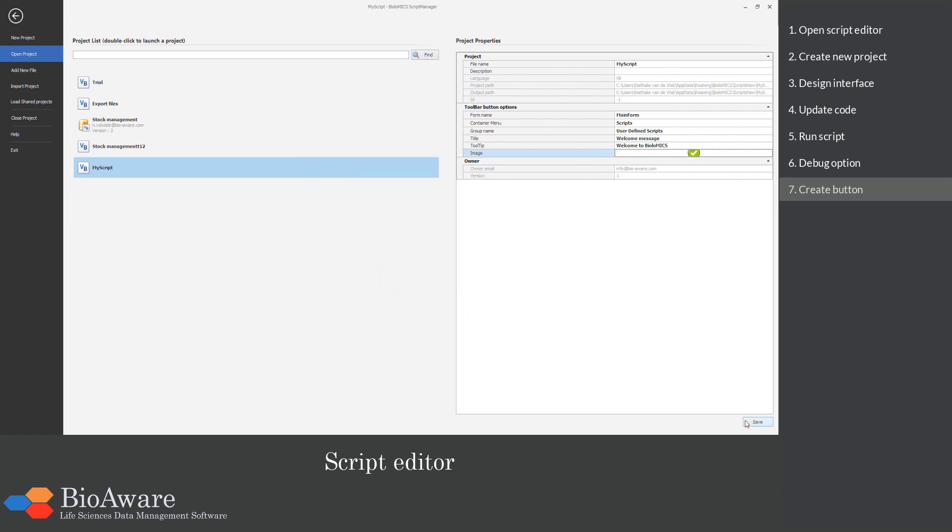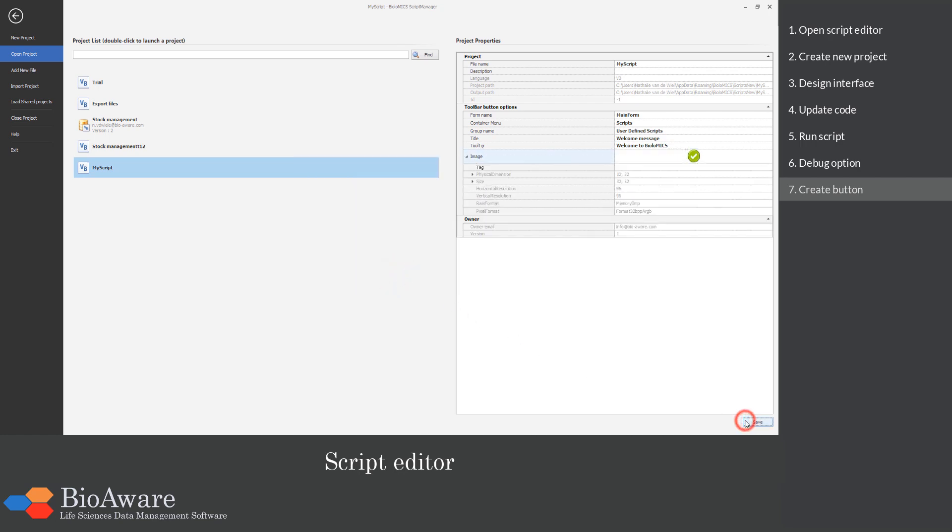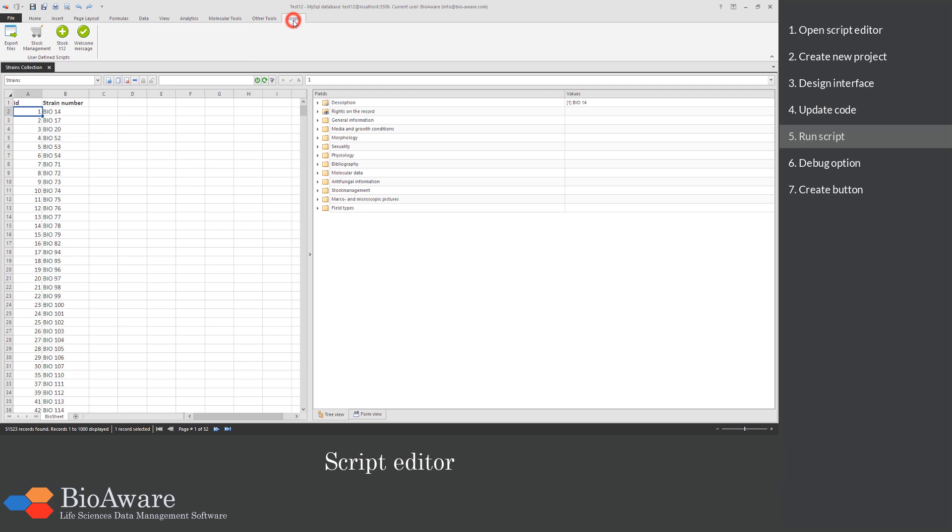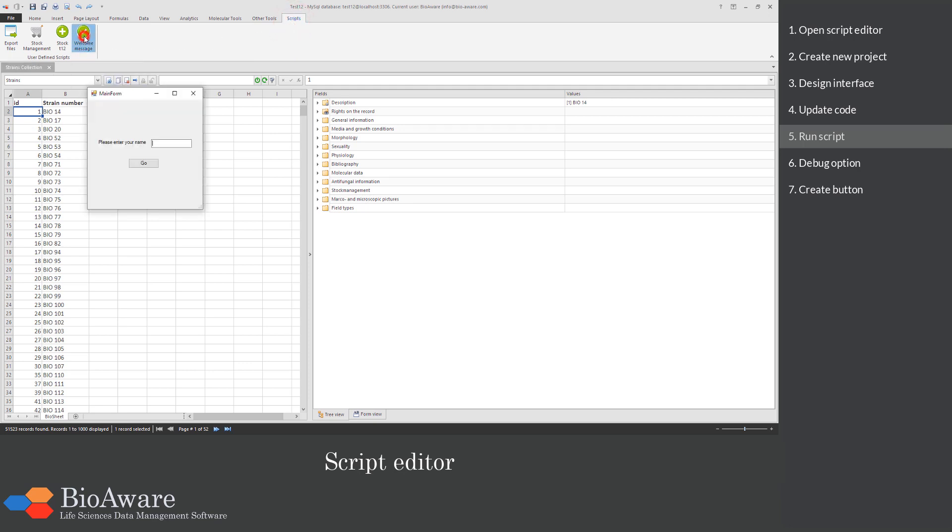When you are done, click Save. When we now go back to the main window of Biolomics and we go to the tab Scripts, we can see our newly created script. Click on the script to run it.